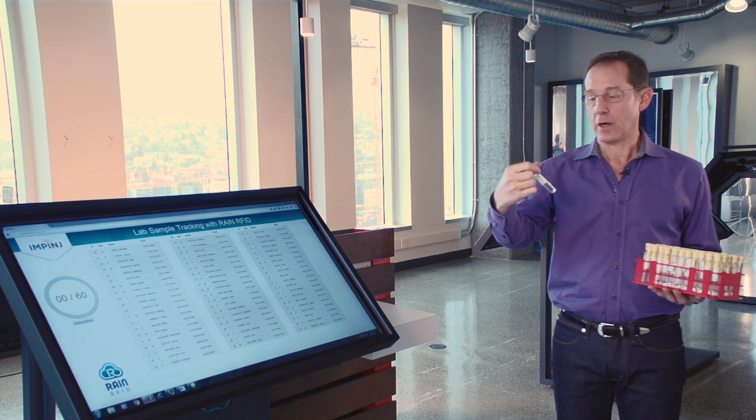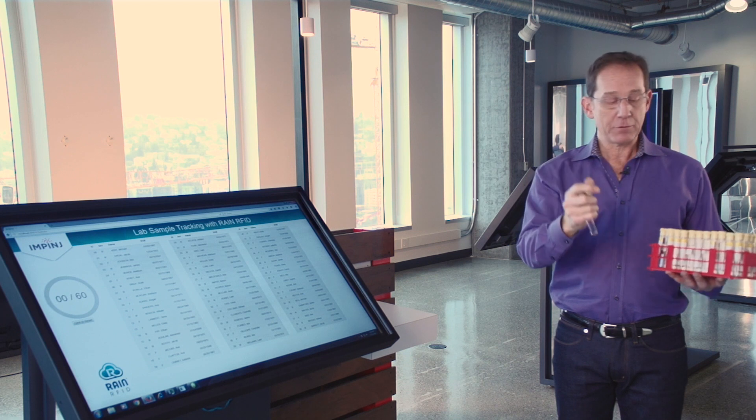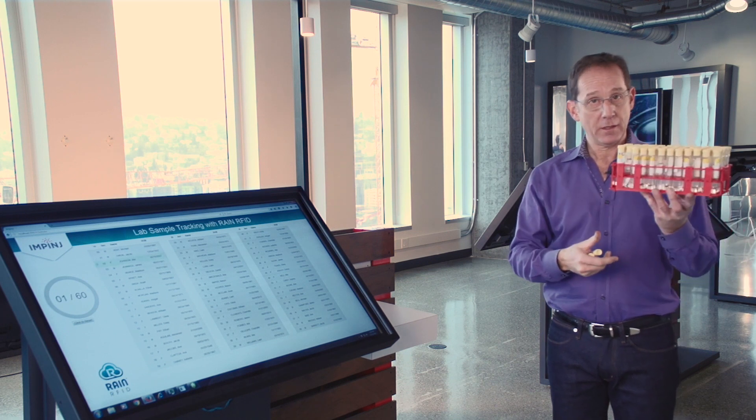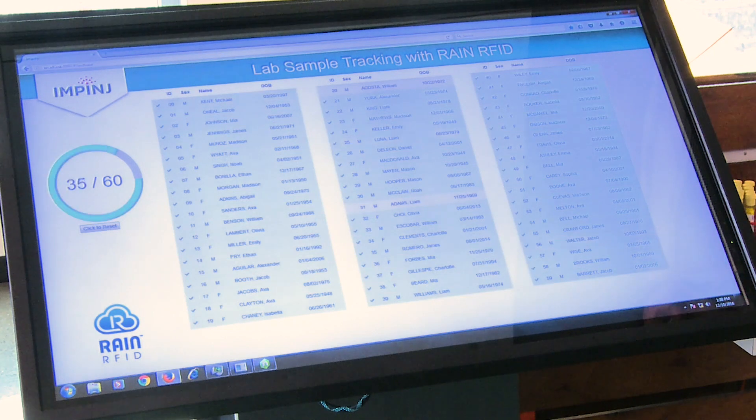Each one of these vials has a number on it. This one's number 20 and this one's number 31. I'm going to show you now what happens when I take this rack of samples and place it on the test table.